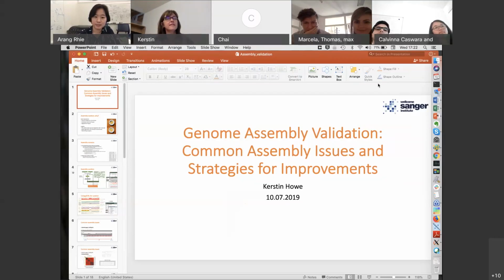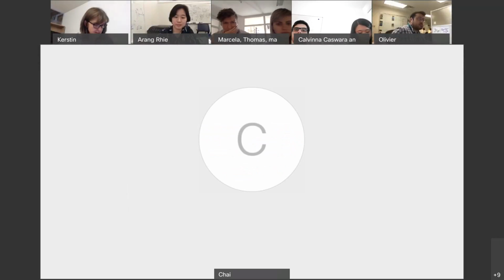Right now we have like 10 BioNano and Hi-C. I heard there's a strong interest, let's say if you want to scaffold, maybe you can try Hi-C, for example. But right now, it seems to me that the bioinformatic tools for Hi-C scaffolding are quite limited. So far I know HiRise, where the only version they released was back in 5 something, and now we have SALSA 2, which is a lot more active. Besides SALSA 2, which we use nowadays, do we have any other tool out there that you have already tried that does a quite good job?